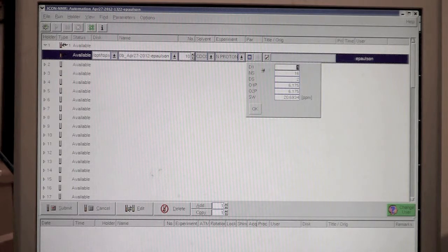However, to know the proper setting for this, you should know the T1 of your protons. Typically, to be more quantitative, you're going to need to be on the order of like 10 seconds per scan for a small molecule. 1 second is a good number to get data in reasonably quickly without saturating the signals.